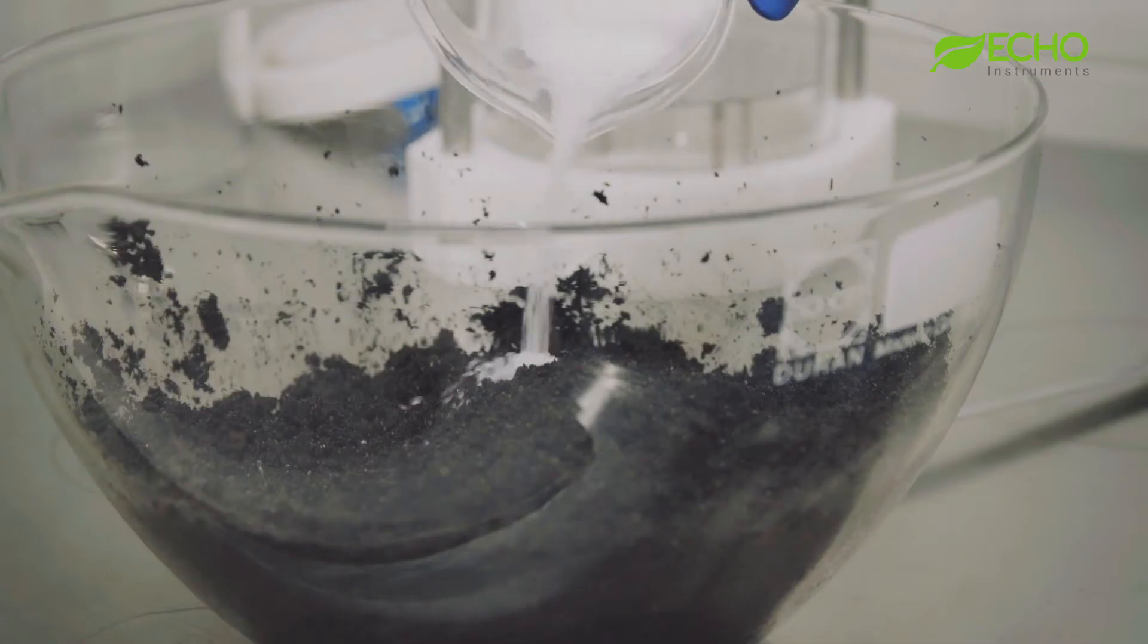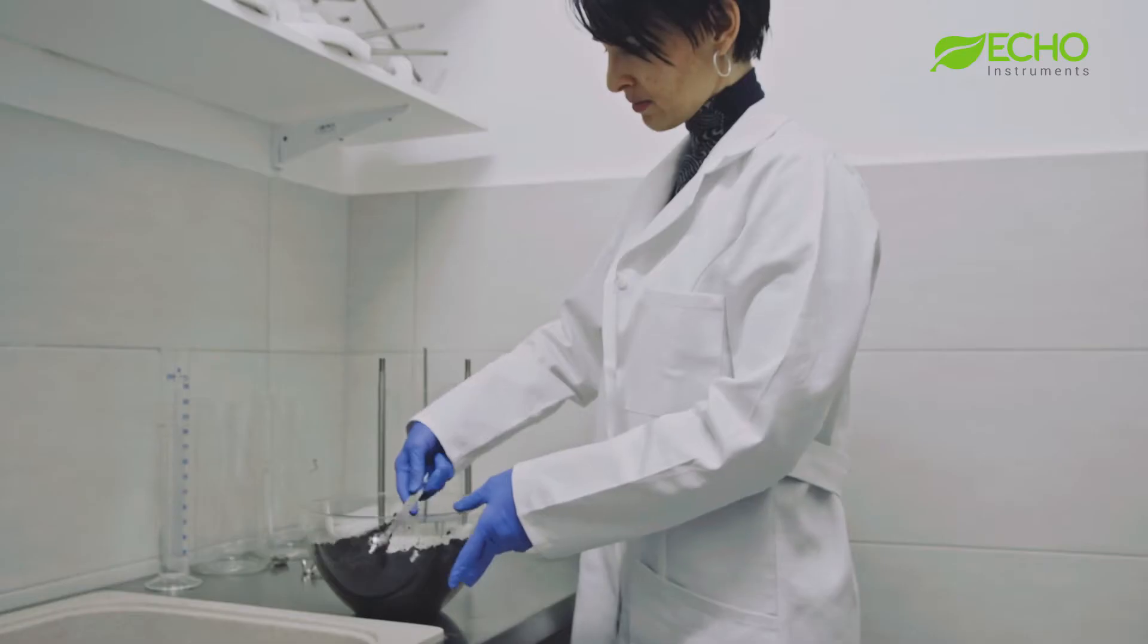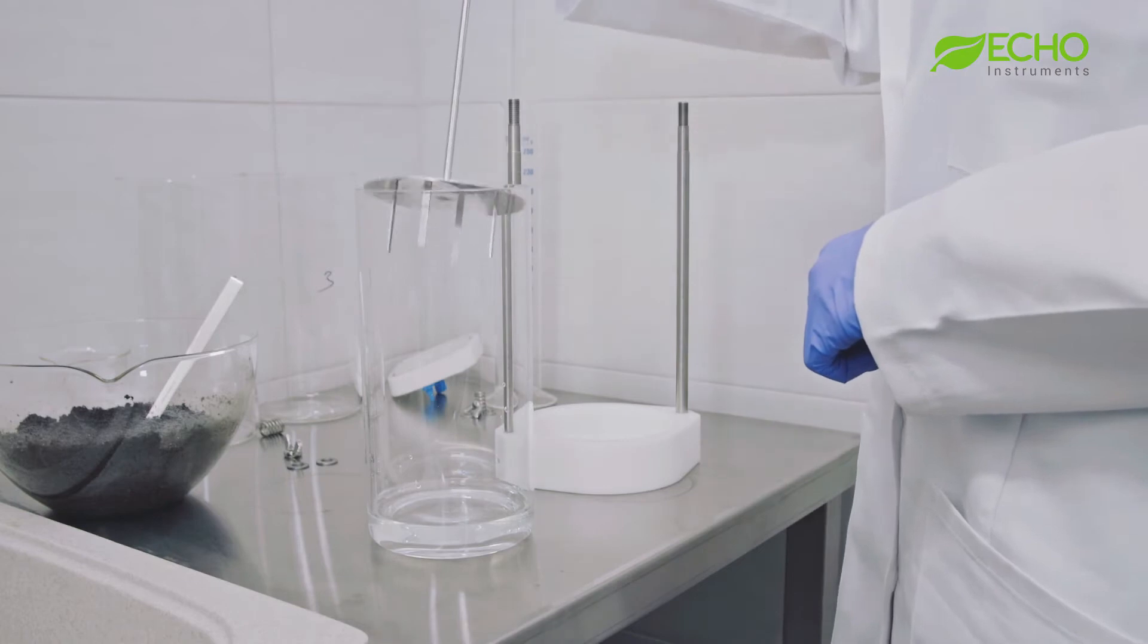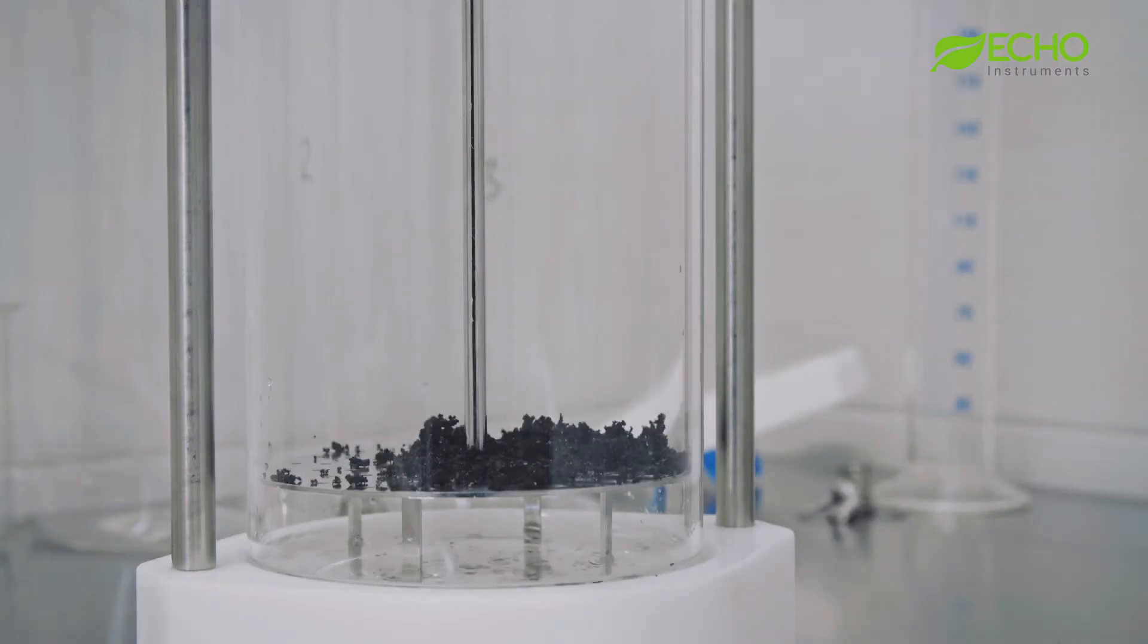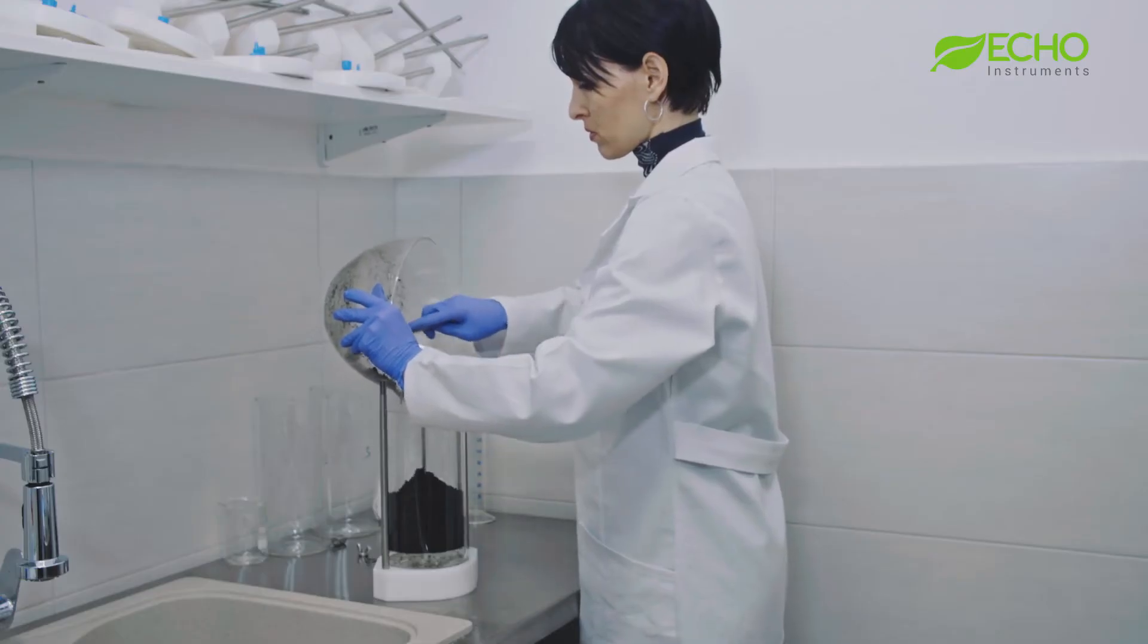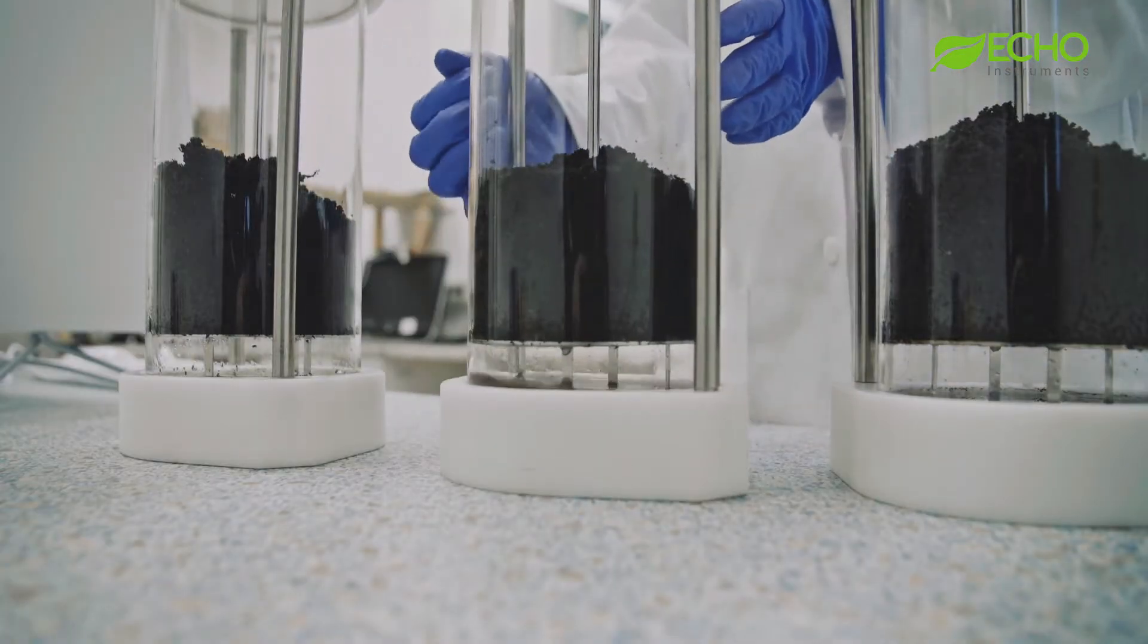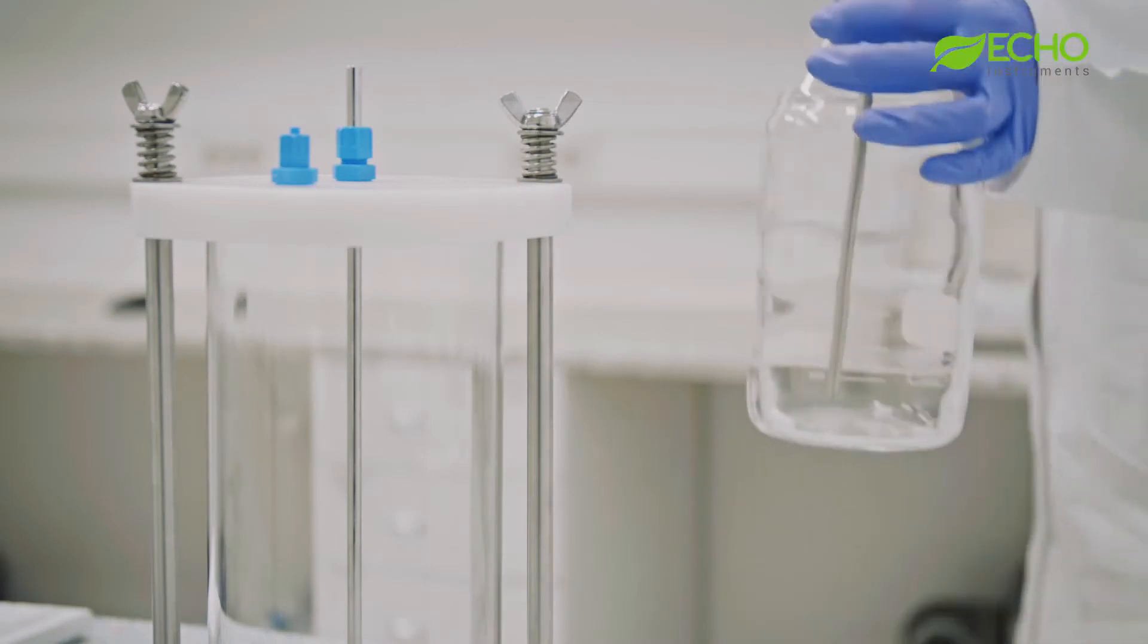After that, the compost can be mixed with bioplastic samples. The samples are transferred to reaction vessels for the biodegradation process under controlled conditions. The vessels are placed in a thermostatic chamber with a constant temperature. There, the vessels are connected to the analytical system for aeration and gas analysis.